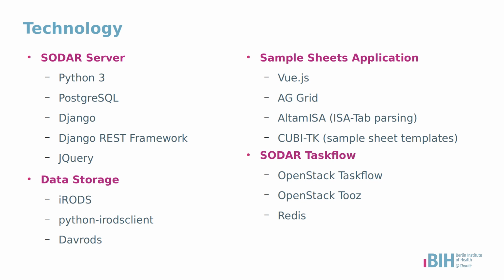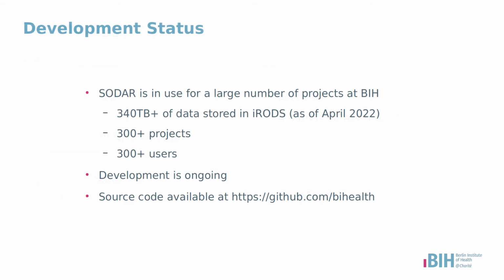SODAR is based on open source technology. It is built using Python, the Django web framework, and Vue.js. SODAR has been in active development for several years. It is currently in use in a large number of projects at BIH. Development is ongoing and new features are constantly introduced.